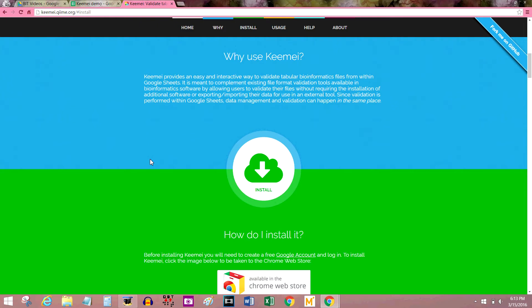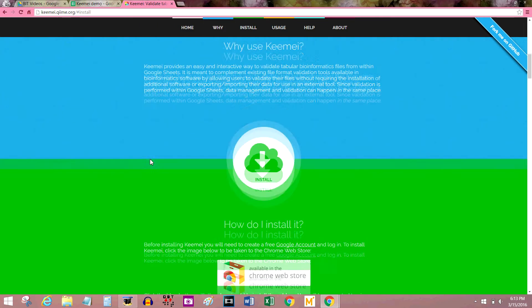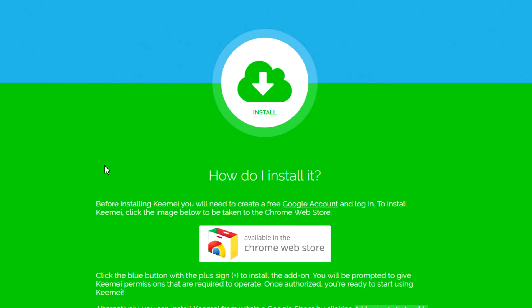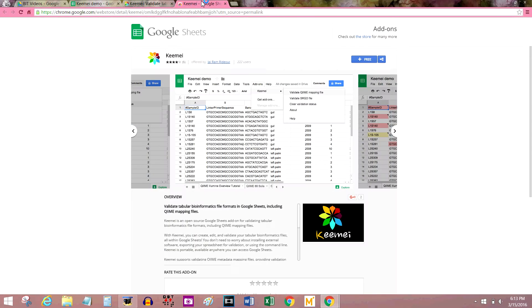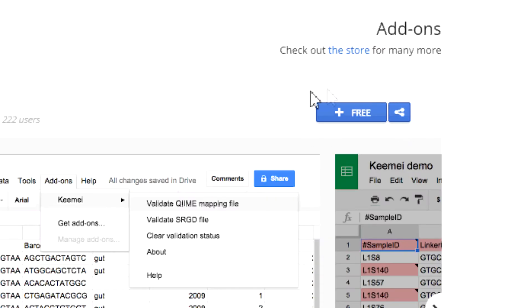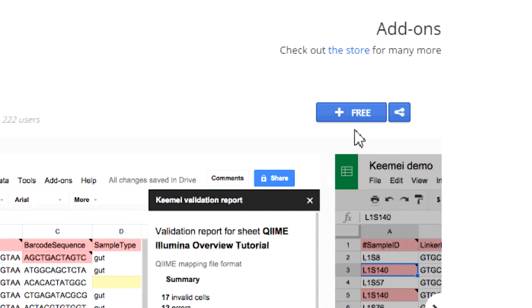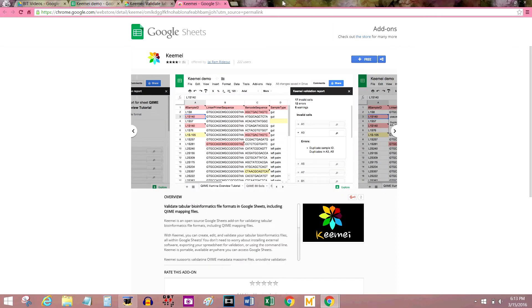There are two ways of downloading it and I'll show them both to you. You can follow this link to go to the Chrome Web Store and press the blue button that says "Free" on it to download it to Google Chrome, which is what I'm using right now. You don't have to be using Chrome to download this add-on — you just have to be on a browser that supports Google Sheets, which is I think all of the major browsers.